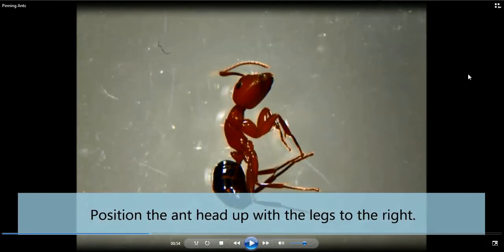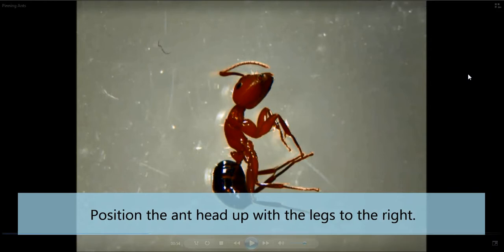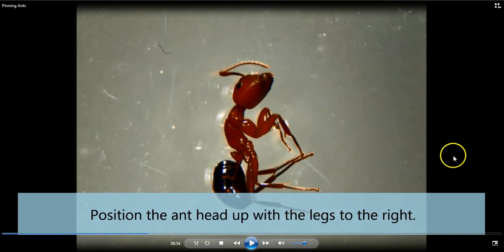Once you get the ant with its legs in the proper position, a little trick to make sure it's oriented properly is to place the ant head up with the legs pointing to the right. We're actually working on a microscope slide here, so you can turn the ant or turn the slide if you want to.